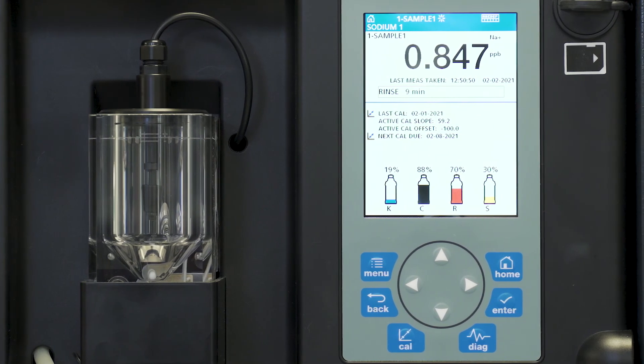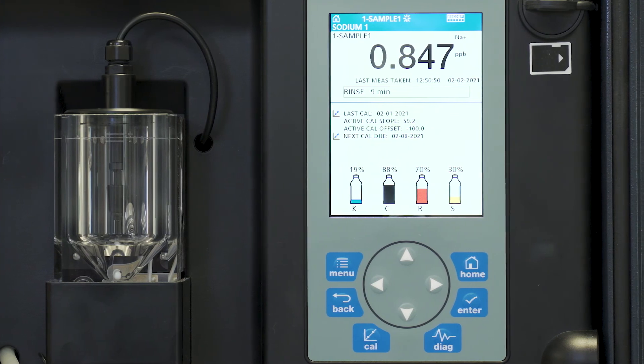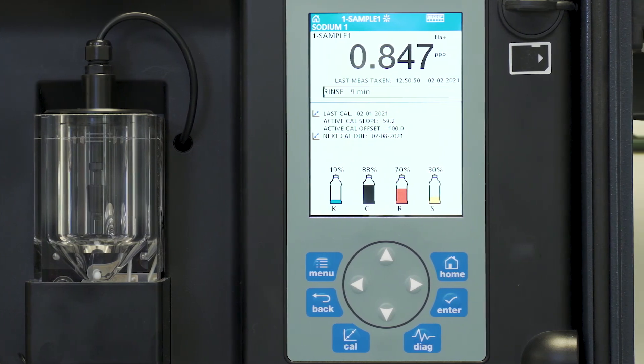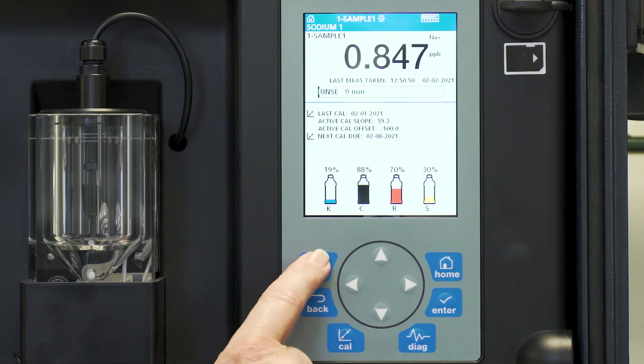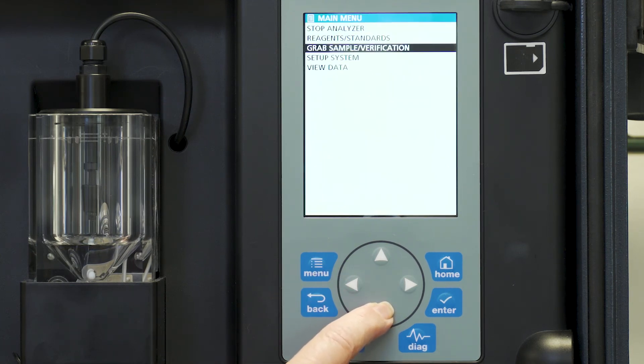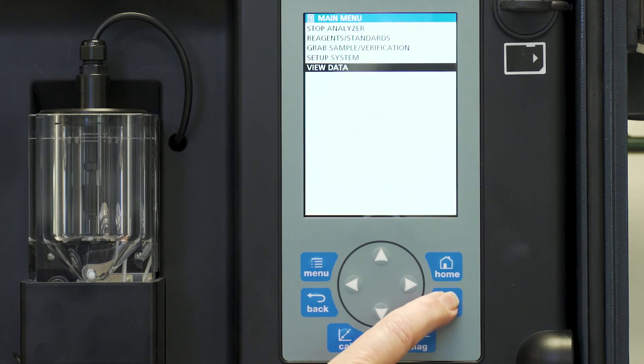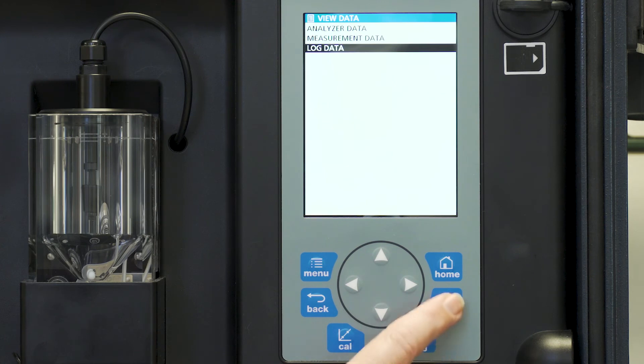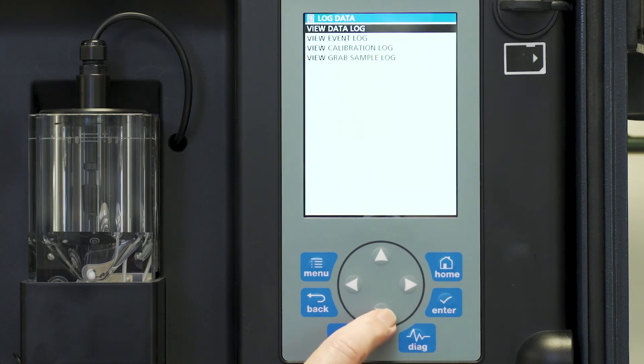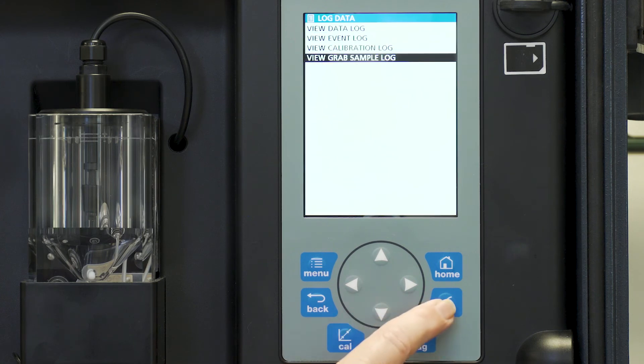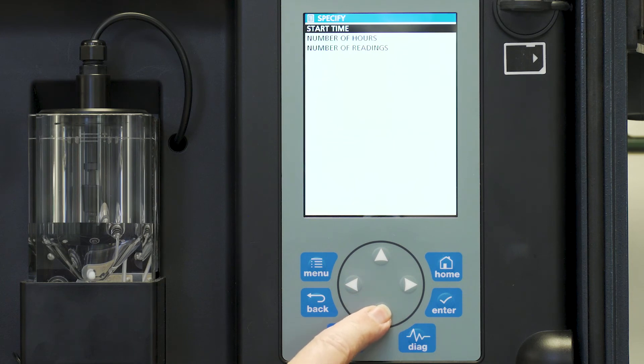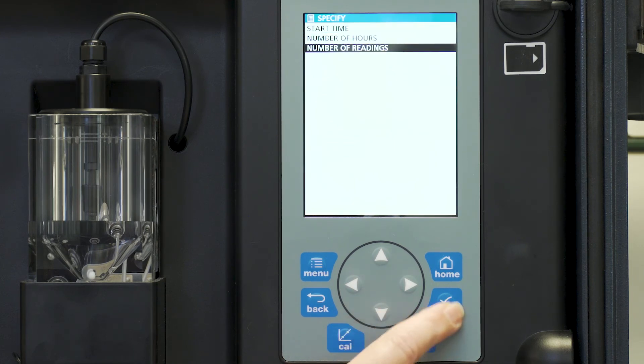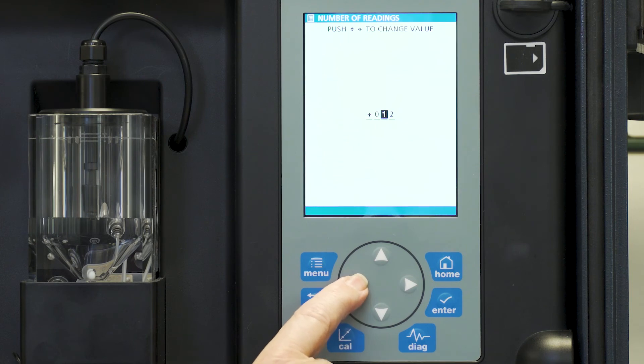The question being now is where is that measurement? This measurement has been stored in the data log. To find the results of that measurement we go to menu and we move to view data. And we want to look for log data. And of course we want to view the grab sample log. And we want to look at the start time or number of readings. Let's look at the last three readings.